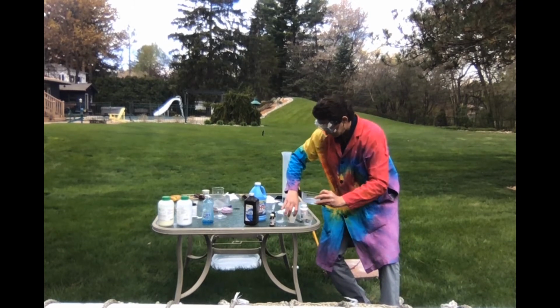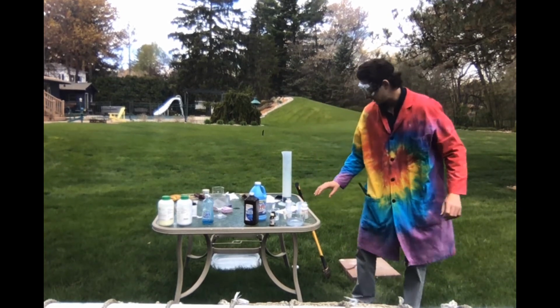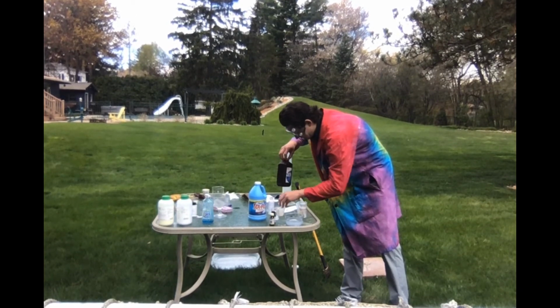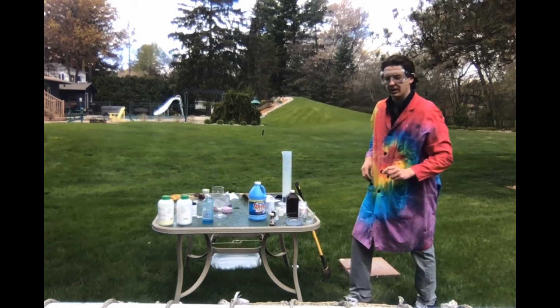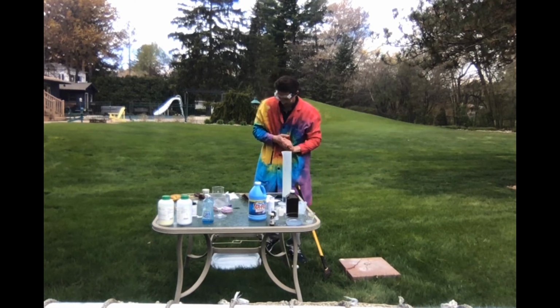I'm going to just let this sit right here, and you guys are going to watch this as I continue. Let's put a nice dark background behind it so you can see, and let me know when something happens to that. Hopefully you guys can see that.